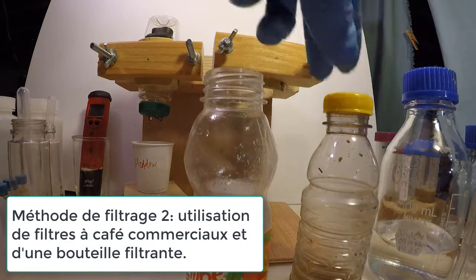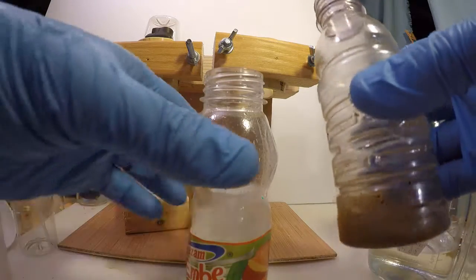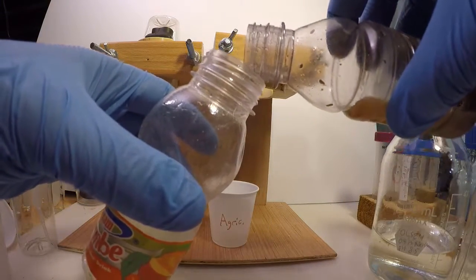Okay. In the second method of filtering, we just pour the settled solution into the second filtering bottle with no need to use a transfer pipette.